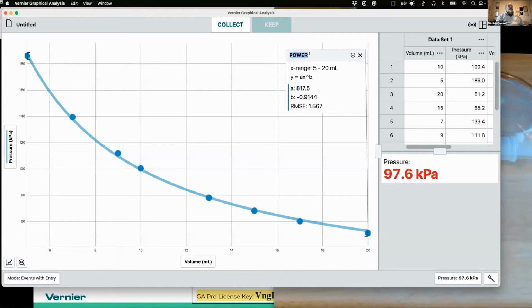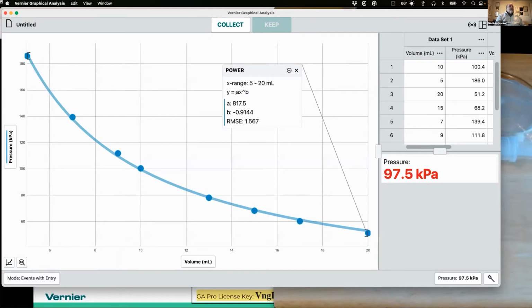And you look at this and you go, well, y equals some constant times x raised to the, well, in this case, -1 is what it should be, but it's 0.9. Is that error? Yeah, it is. It's human error. It's actually an error we know about. Let me show you what I'm talking about.